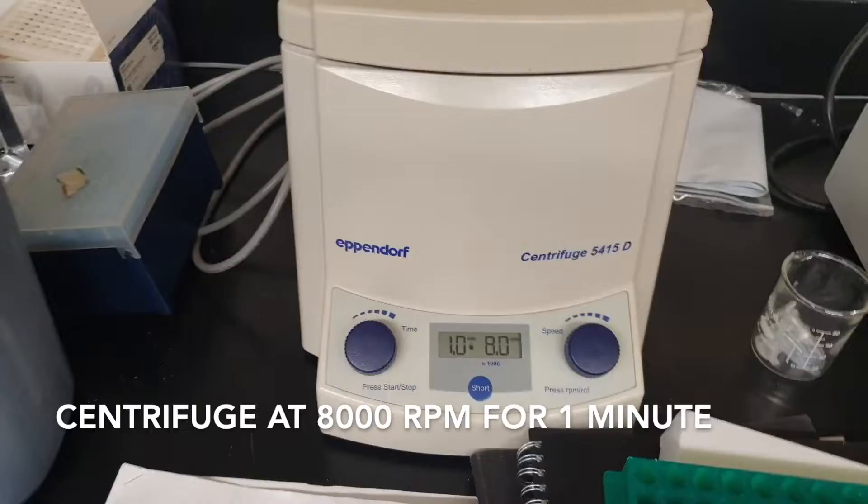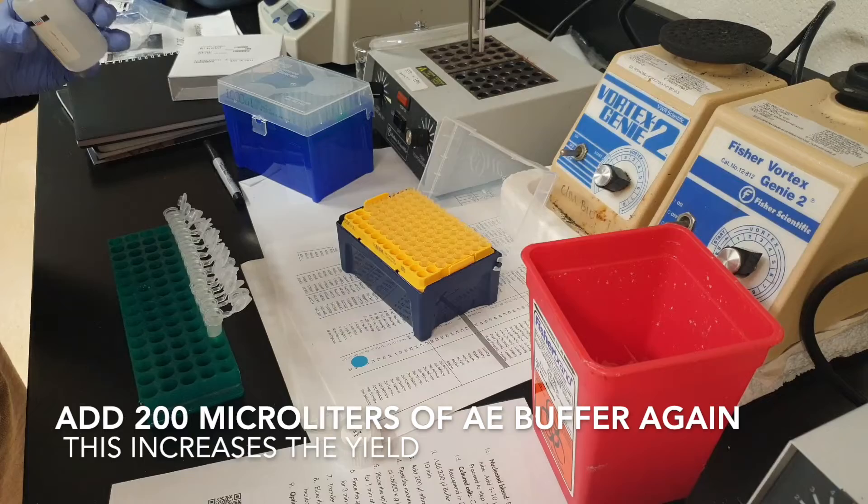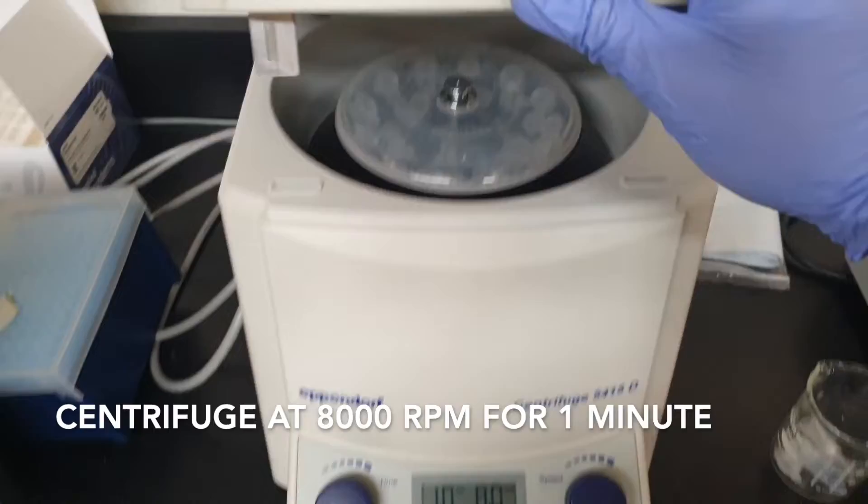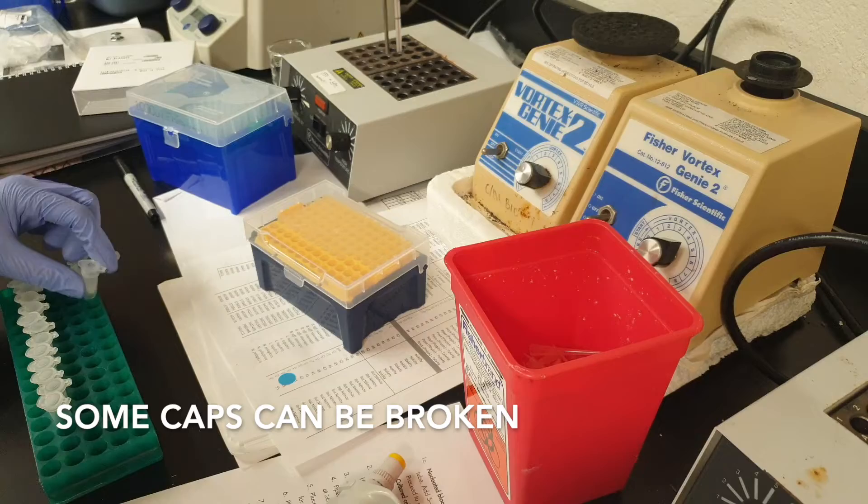You're going to add 200 microliters of buffer AE. Centrifuge at 8000 rpm for one minute. Add another 200 microliters of AE buffer again; this is going to increase the yield.